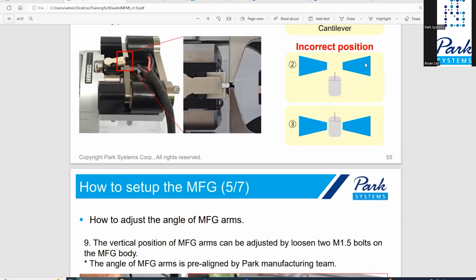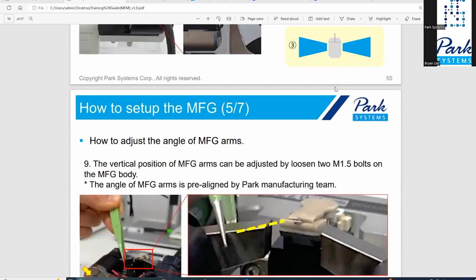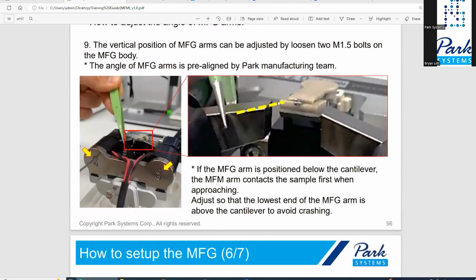So this is the plane of the magnetic field. So you're applying in the in plane of the sample, not on the out of plane of the tip. So this is the external magnetic field, and the external magnetic field is applied in plane, so you will not affect the tip that much. So then look at some other questions.